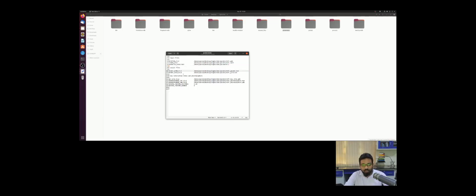Next are the output files which we will get. We have to mention where these files should be written and what the file names should be. It is going to generate pocket.txt and grid.txt, two text files. I gave the names 4dfr_pocket.txt and 4dfr_grid.txt, but the name can be anything. I directed these files to the same current directory, pocket.